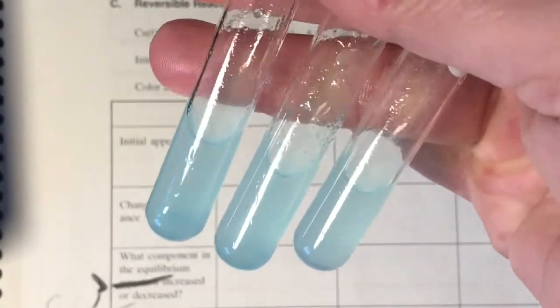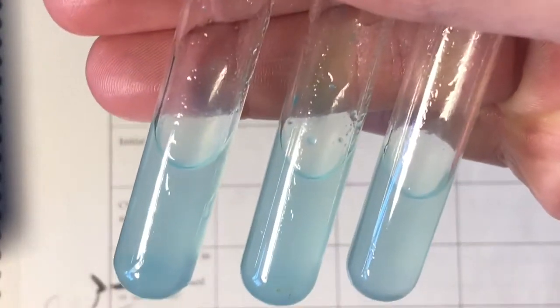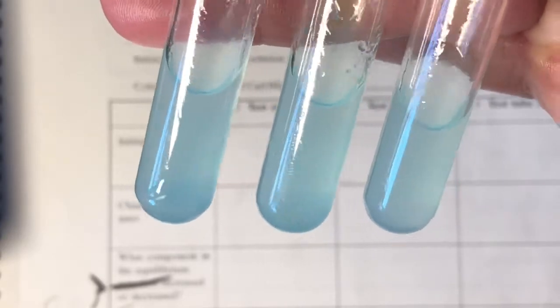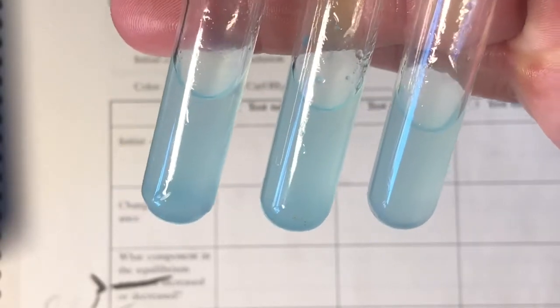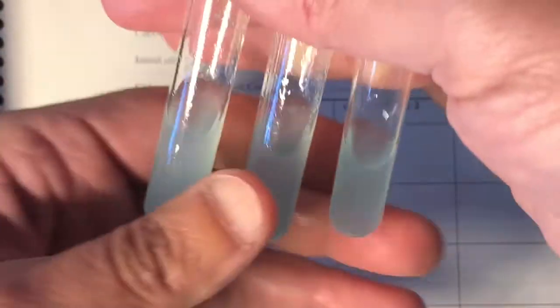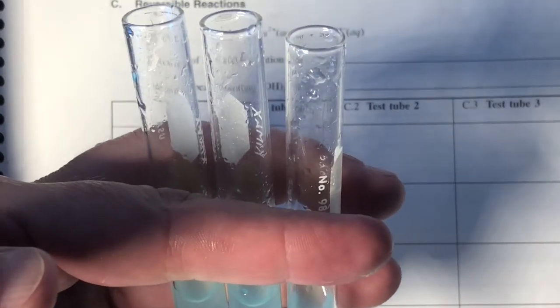All right, so here's our 3 test tubes of the copper hydroxide in equilibrium. And what's important to note is that it's both a little bit blue in color, which is the copper ions in water, and also that it's a little bit cloudy, which says that we have a suspension of the copper hydroxide solid. All right, so to these 3 test tubes, I'll add the sodium hydroxide to the first one.